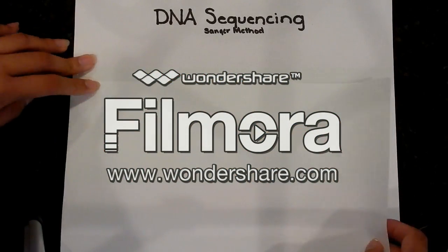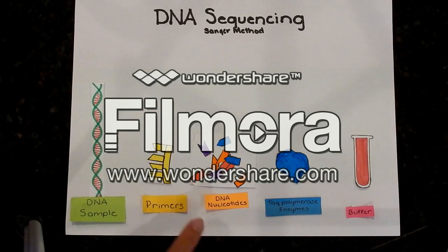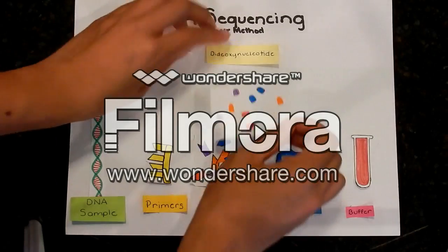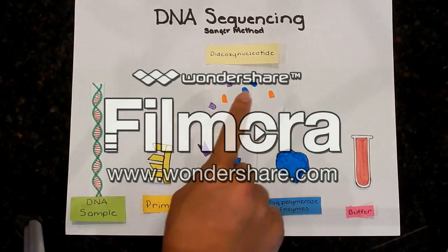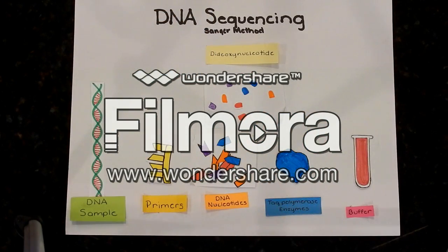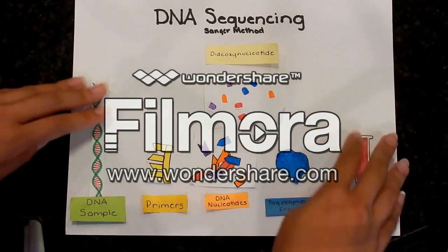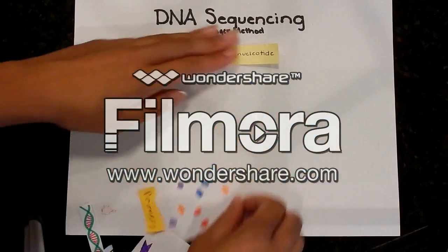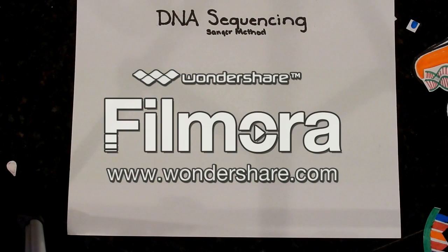DNA sequencing uses the same 5 primary ingredients as the PCR cycling does. However, it adds one more ingredient that's very necessary for the process to work, and that is dideoxynucleotides. Now I'll explain this. Dideoxynucleotides are very similar to regular deoxynucleotides, besides one primary aspect in their structure.